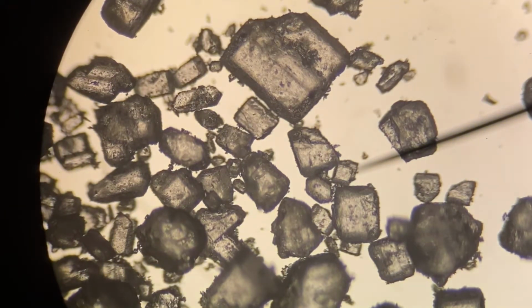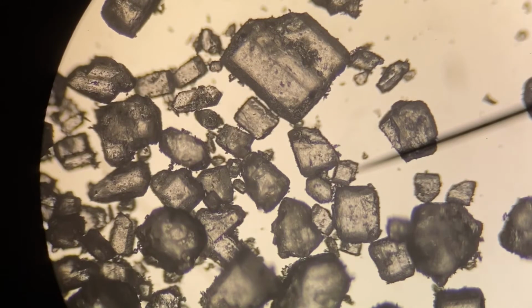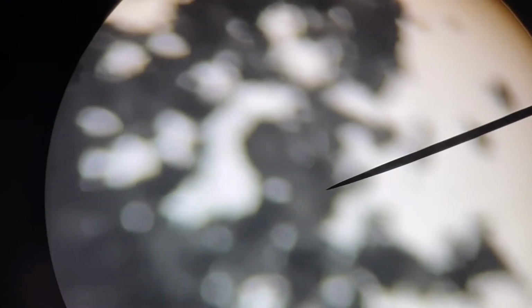So the molecules align in a way that's kind of uniform or interesting that creates these edges or angles on each piece of sugar, and that is a crystal, okay? A crystalline structure, when the molecules link up to form this kind of crystalline structure. Okay, so that is granular sugar. Let's take a look at what the sugar looked like when I ground it down into powder form, shall we?